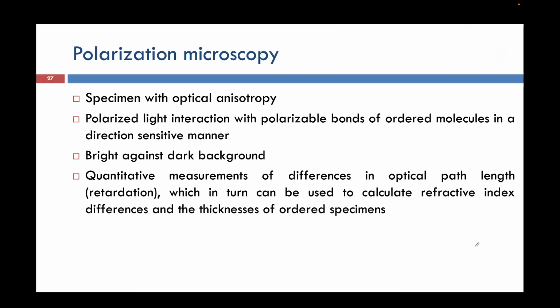Okay, then comes polarization microscopy. So what do you mean by polarization microscopy?